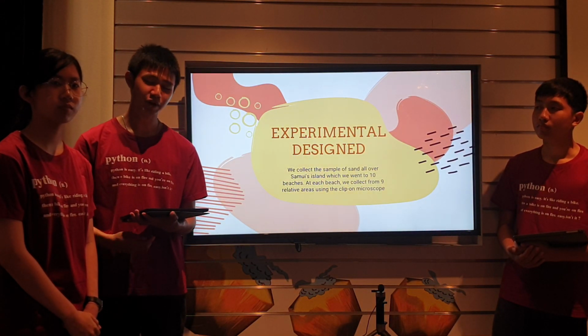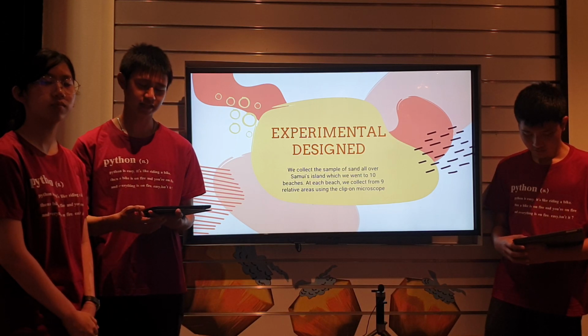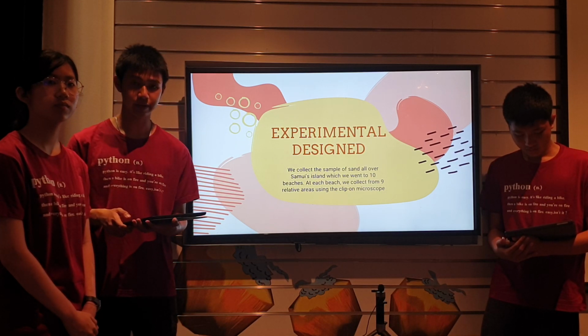Next is the experimental design. We collect samples of sand over Samui Island. We went to 10 beaches. At each beach, we collect from 9 relative areas using the clip-on microscope.